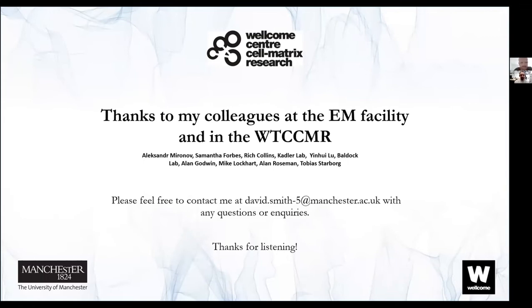Actually, they're not negatively stained. And for tomography, we're using standard routine TEM preparation, which involves positive staining. So actually, most of the structures look like dark material on a transparent or white background. So there is no problem in differentiating, if you know the shapes, of course, and recognize patterns. There are no problems in recognizing cellular components. And for particles, I think tomography is not used for negative stain particles in most cases.